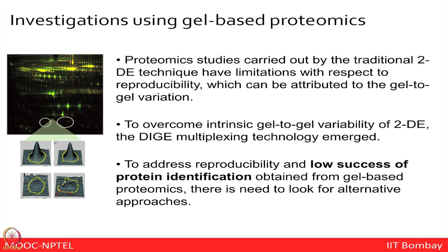If we now want to summarize, I have just shown you data from the lab, where after comparison you can see 3D views of the spots from the DIGE gel. The bottom panel is for the control spots and the top panel for the disease spots. Something very interesting here: the three-dimensional view shows higher expression of this protein in a given disease context.